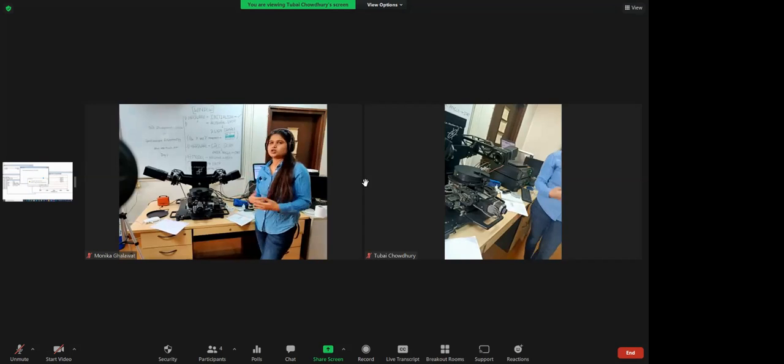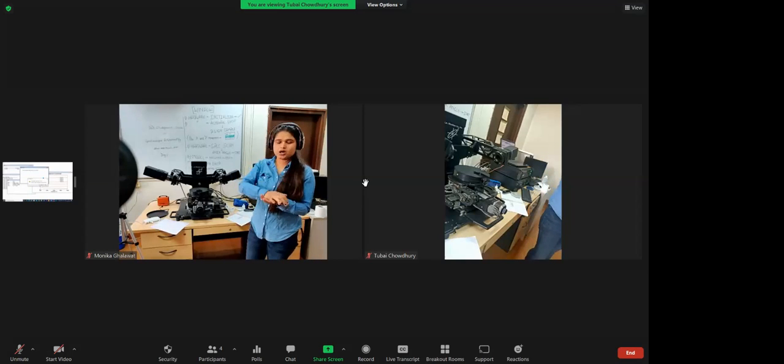Your sample can be optically smooth or not. If I am making some solution and just mounting that on the glass slide, it will not be optically smooth. So there are methods to prepare fine thin films which are optically smooth and which are very fine.